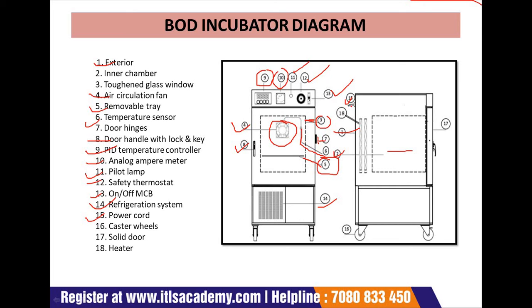This one is the power cord, and 16 is the castor wheels. You can just go ahead and back, you can move it by these wheels. And 17 is the solid door. This is the solid door system. And now 18 is the heater. So 18 is this one. This one is a heater. By the heater you can increase the temperature according to your need.